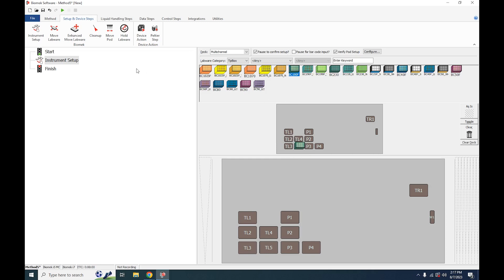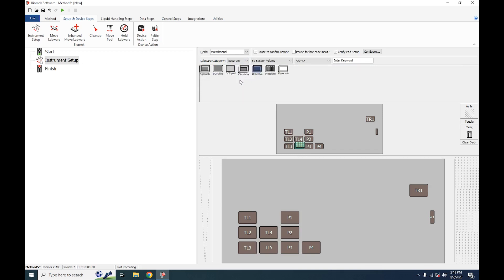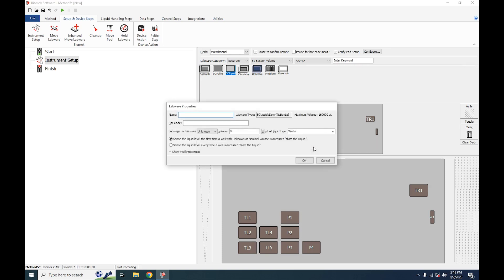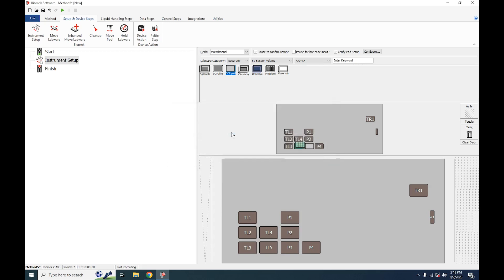The next thing we need to define is our reservoir. We're going to go over to Labware Category, and under the dropdown click Reservoir. For us we will be using the upside-down tip lid, so we're going to drag that to position three. After dragging there, we're going to define our reservoir with a known volume of 100,000 microliters of water.